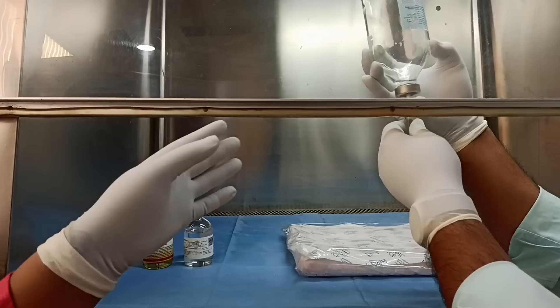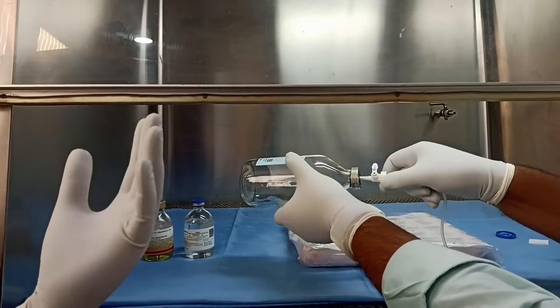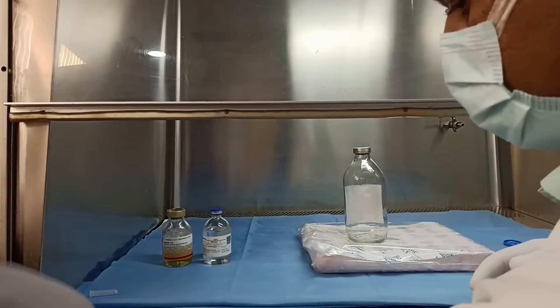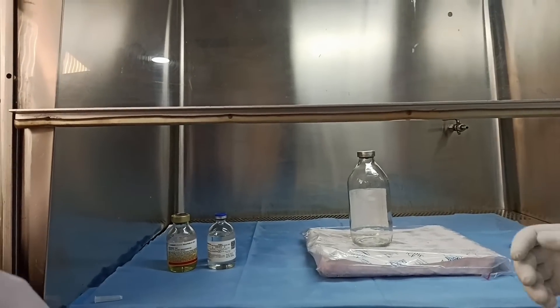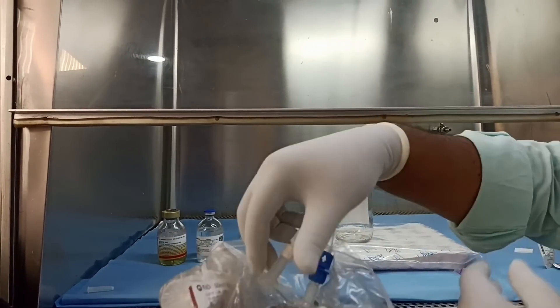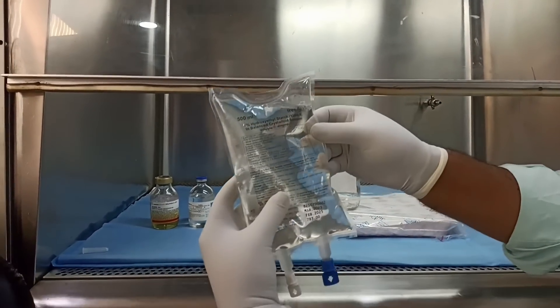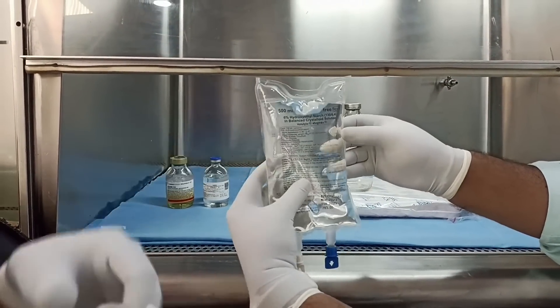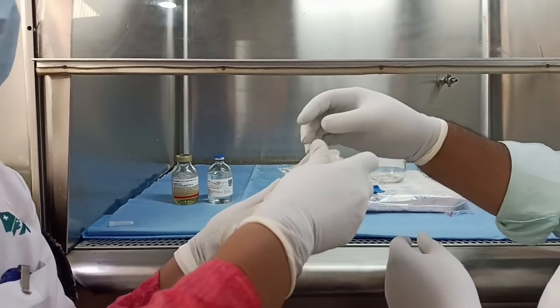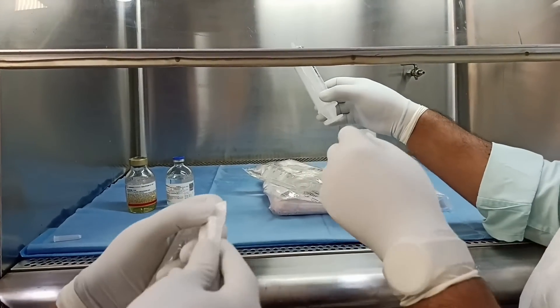Now we have emptied the glass bottle and all the normal saline has been transferred to another beaker. Next, we will be rinsing the glass bottle with HES. We take about 30ml of HES and flush the entire bottle so that any remaining normal saline is removed. We will take a 50cc short-tip syringe and a 16 gauge loading needle to draw the HES.